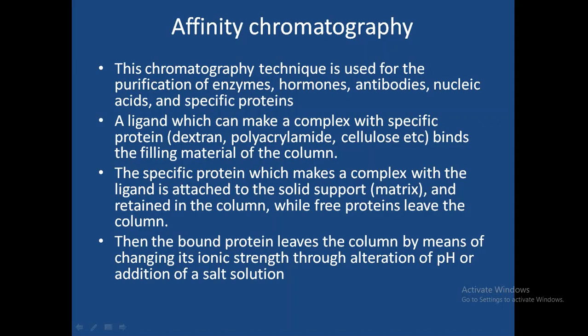The specific protein which makes a complex with the ligand, the protein which is present in the sample, will have an affinity with the ligand which is attached to the solid support. So if the specific protein has the affinity towards the solid support material only, we can get the separation.